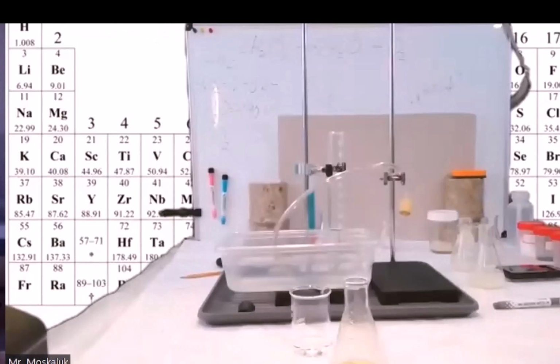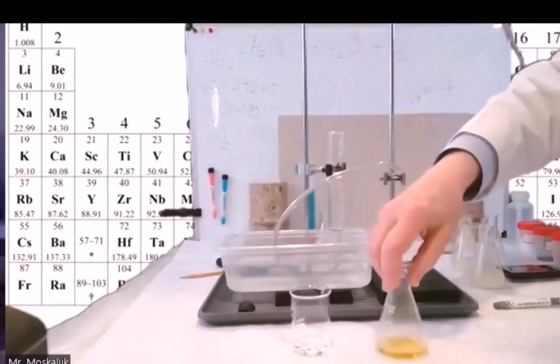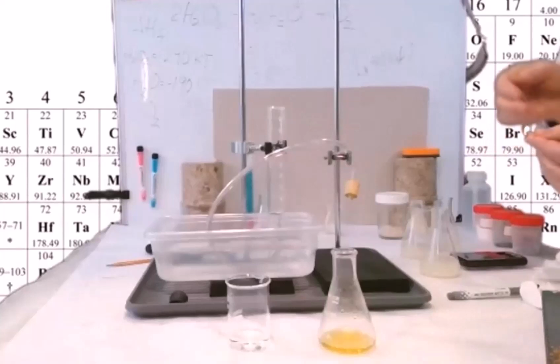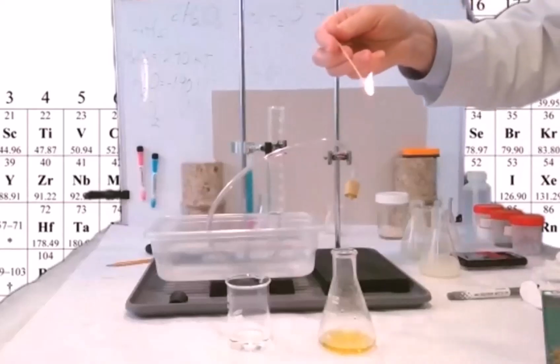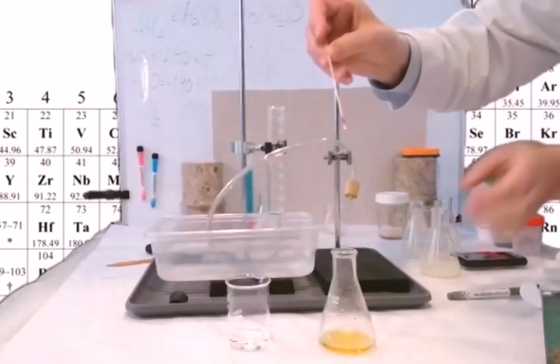Camera's there. I'm glad you said that because this is one of my favorite things. This is a lab demonstration that used to be a classic in chemistry classes. It's the glowing splint demonstration. And as I said, they don't do this anymore because a lot of labs don't allow fire anymore. I'm going to take my match and get this splint. Every lab used to have splints that you would light. And I'm going to blow it out. And there it is, glowing.